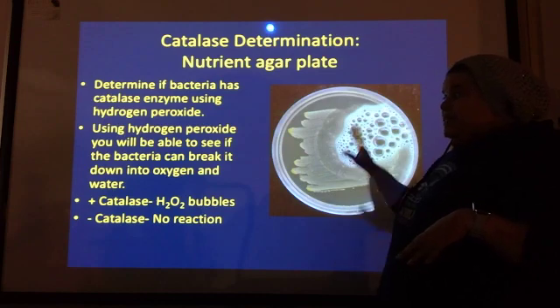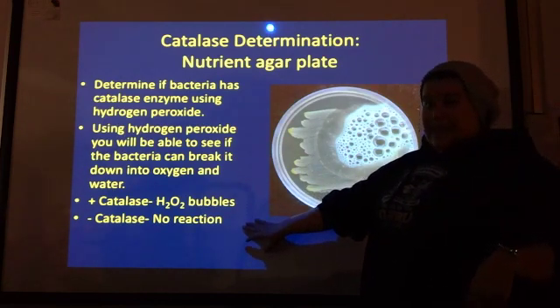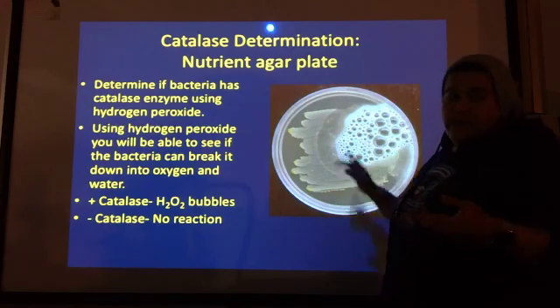So for this specific test, it's either positive for catalase or it's negative. If you don't see any bubbles at all, then you just kill the bacteria, but it's negative.